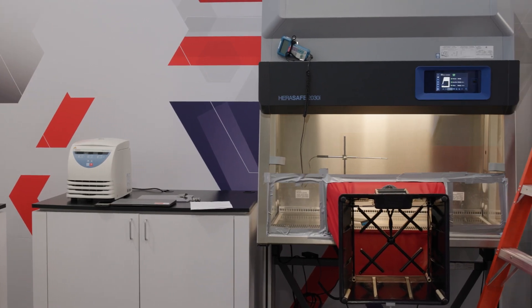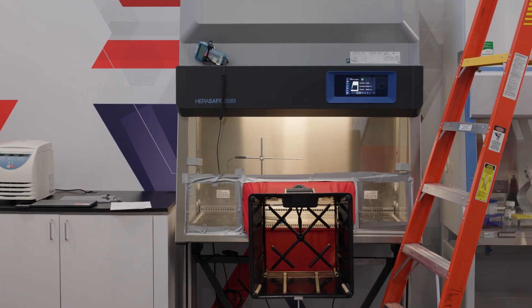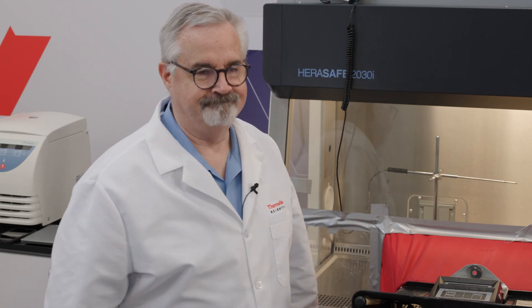Welcome to No Notes Needed. My name is Natasha Fitch, Commercial Manager for Biological Safety Cabinets at Thermo Fisher Scientific. Today we're going to demonstrate how Thermo Scientific HERASafe 2030i Class II BSCs use Smart Flow Plus technology to help protect samples. We are joined today by Dr. Dave Phillips, our Senior Global Product Technology Specialist at Thermo Fisher Scientific.